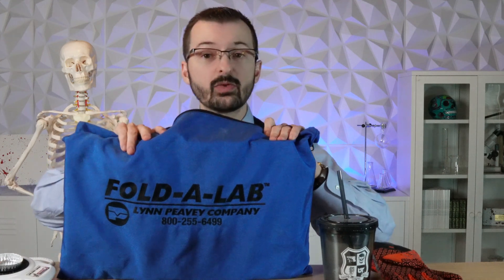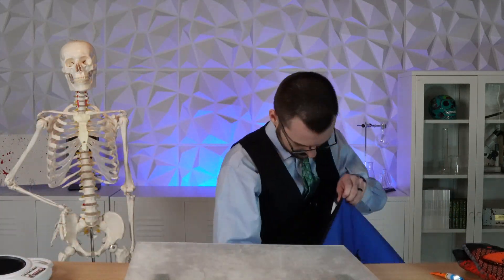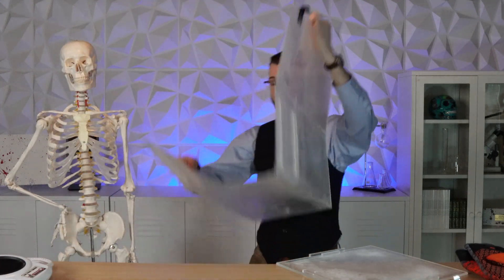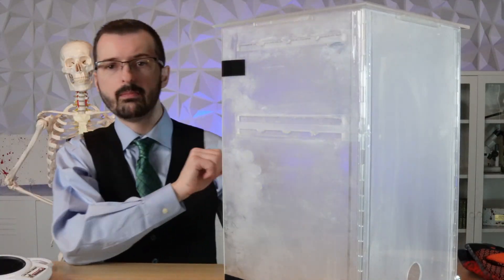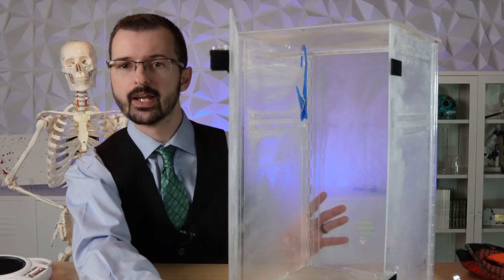We're also going to need a portable superglue tank. I've had this one for several years. It's pretty neat. And with the magic of editing, we're going to fast forward while I put it together. And boom, there you have it — a portable superglue tank.